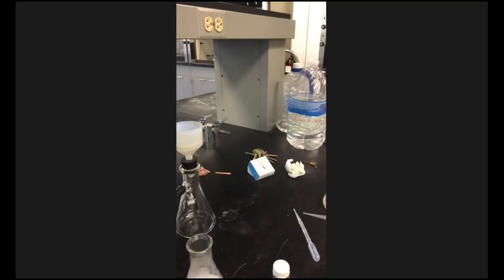And the procedure says it doesn't have to be room temperature. It just needs to cool off a little bit, right? And it was only 50-something degrees anyway. So technically I could go ahead and filter it now, but I'm gonna wait. All right, so we're gonna wait about 2 minutes before we filter that.